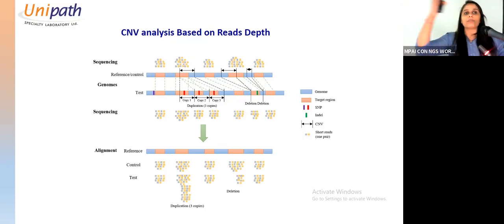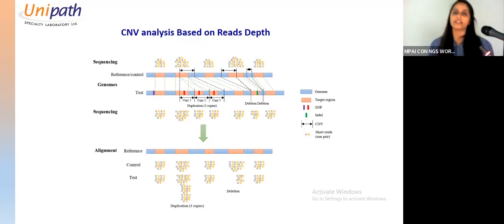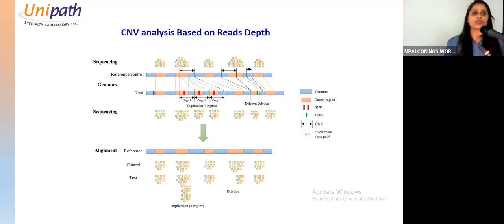Right? If you take a paper that is of red color, one color, and you tear it, you'll get red color pieces only. But if you take paper which is multicolor, and you tear it, you'll get multicolor pieces. So similarly, if you are taking the complete sample, and everything is uniform, you'll get uniform coverage everywhere, because you generated data for the complete exome. But that is not the case, it is a probe-based enrichment, so definitely there is low and high depth, which means you have some places where it is covered and some places which are less covered. So it happens in exome. That is the limitation of exome.